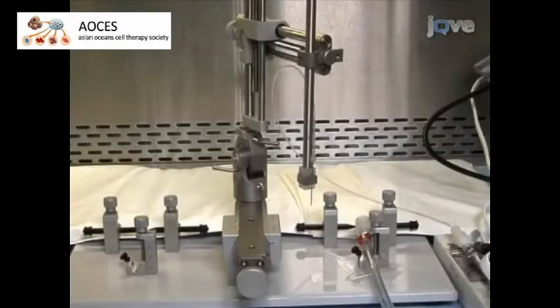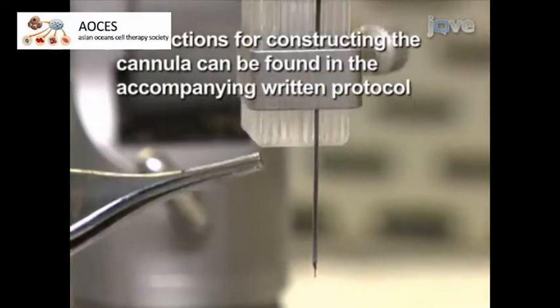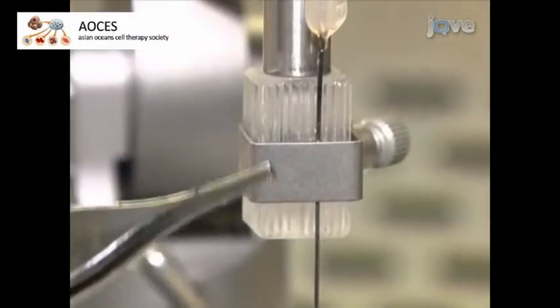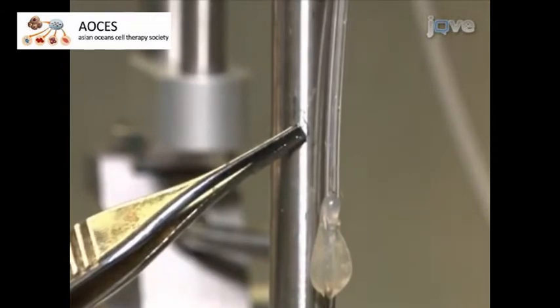Since a reflux-resistant CED cannula for rodents is not yet commercially available, construct a cannula consisting of 3 parts: a 100 micron diameter piece of silica tubing through which the infusate flows, a rigid metal needle for structural support, and flexible Teflon tubing for loading the infusate.